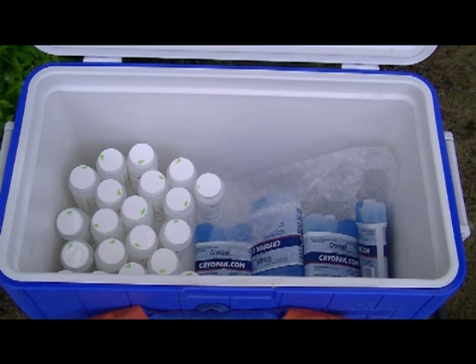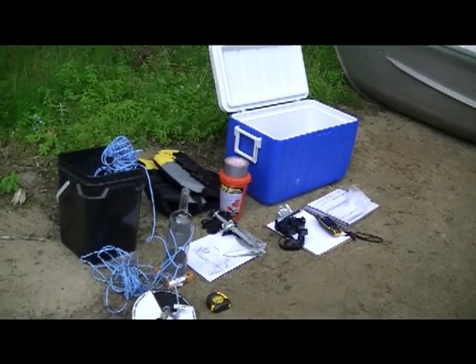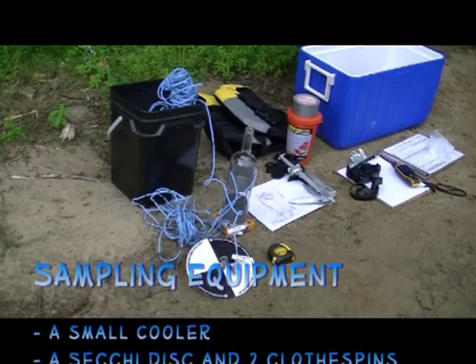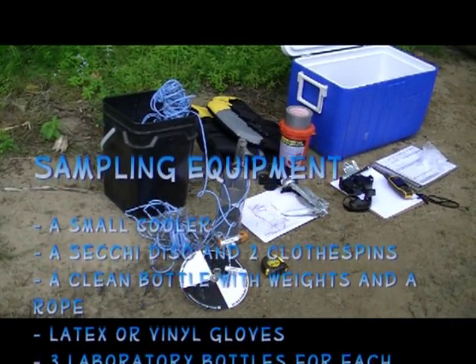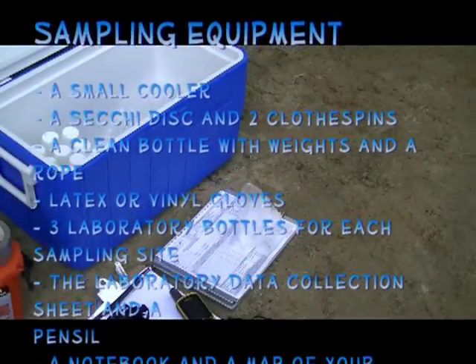As well, you will need a small cooler, a Secchi disc and two clothespins, a clean bottle with weights and a rope to collect your water samples, latex or vinyl gloves, three laboratory bottles for each sampling site, a pencil and the laboratory data collection sheet, and a notebook and map of your lake.